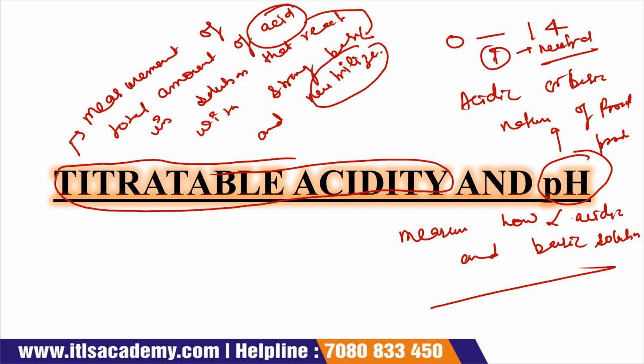This is pH, and the range of pH is between 0 to 14.